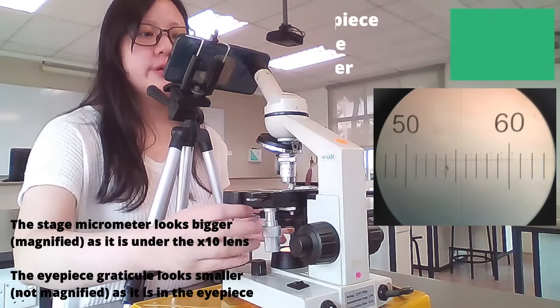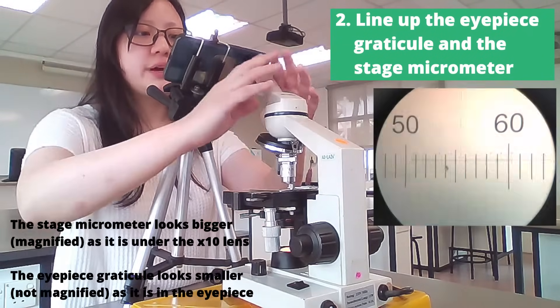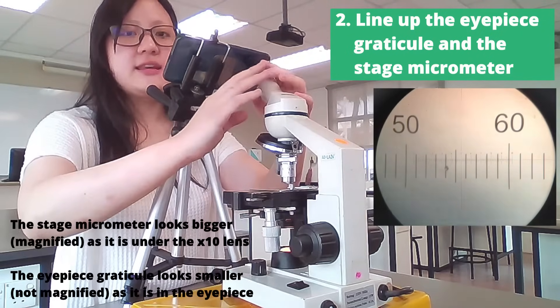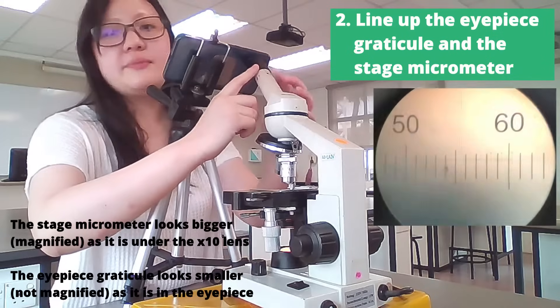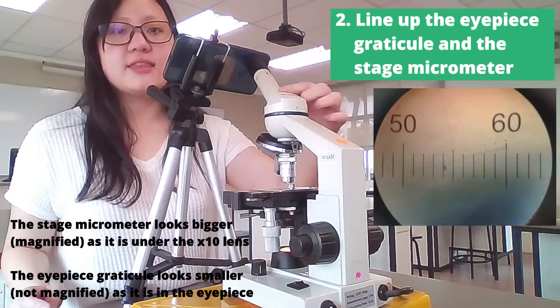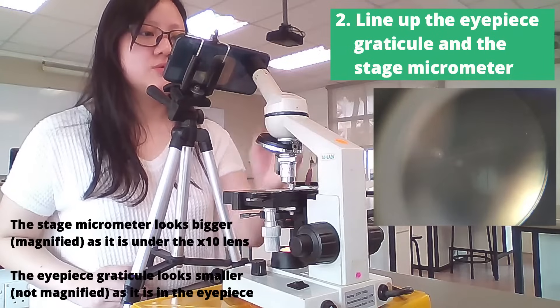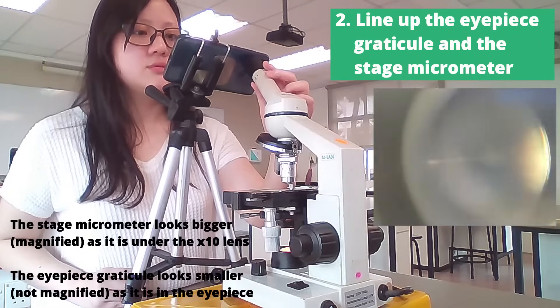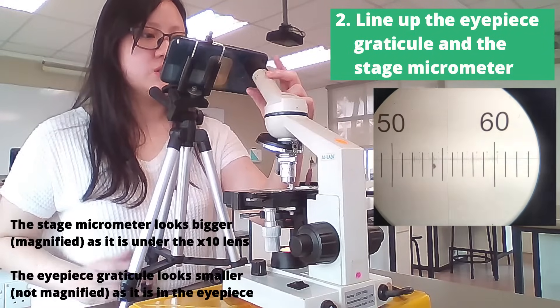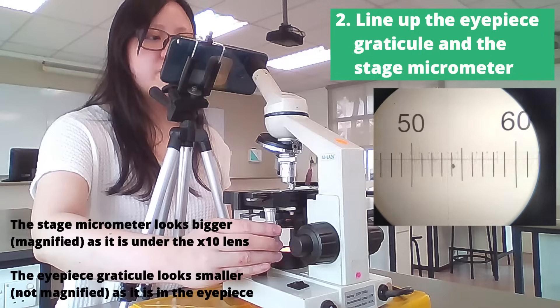What we're going to do is line up the eyepiece graticule and the stage micrometer. The stage micrometer is the one that's magnified — you can see it's big — whereas the eyepiece graticule is at the eyepiece and therefore is not magnified. You can rotate this piece, or even the entire arm, in order to rotate the eyepiece graticule so that they are both parallel to each other. Use the silver knobs to make sure it lines up with the eyepiece graticule quite well.